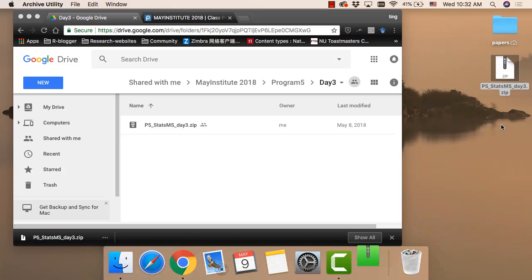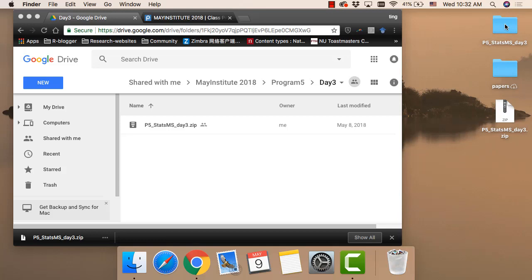Now we have the folder called P5_StatsMS_day3. So in this hands-on, our last hands-on section, we will go over PCA, heatmap, which is cluster. And the very last step, we will learn how to build a classifier.